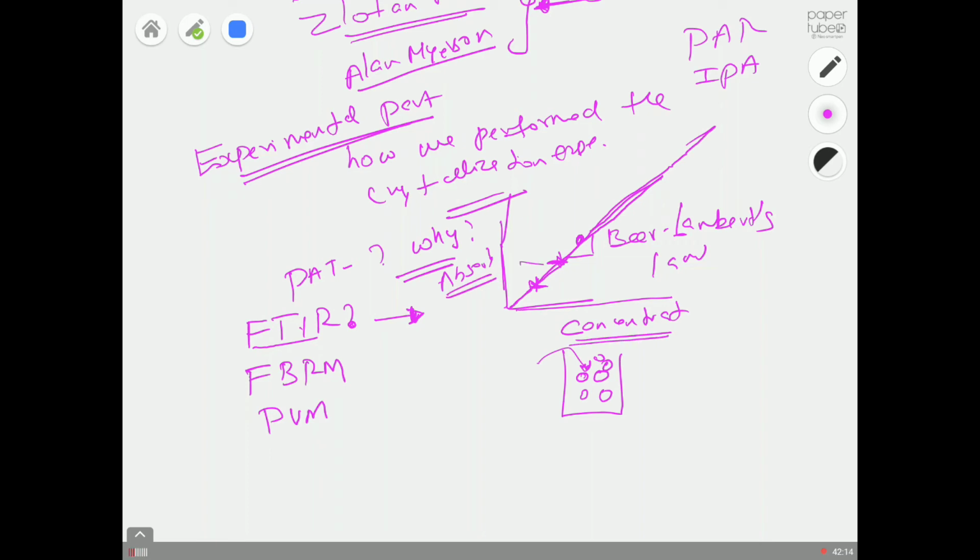Yes. I used a calibration free method which was developed by me. I don't want to load you with the mathematics of how to convert your absorbance units into concentration, but I already converted it into concentration. So I will directly give you time versus concentration, and then I will give you the data that we obtained from FBRM. So try to write the working principles of FTIR and also FBRM.